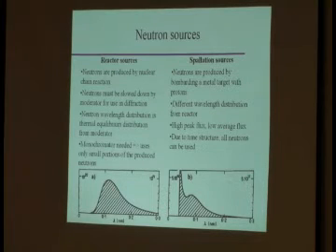Or alternatively, you can actually use these neutrons and do diffraction experiments. So there are actually research reactors where people produce neutrons to use them in diffraction. The neutrons that are produced are pretty fast, so you need a moderator to slow them down so that you can use them in diffraction, because if they are too fast, they'll go straight through your material. They won't ever interact with it. And you get a wavelength distribution that corresponds to whatever your moderator is. Okay, it's the thermal equilibrium distribution of your moderator.